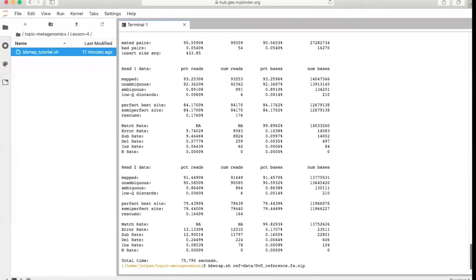And then where you would, if using BBMap, this is where you would tell it the name of the forward read. Now we're gonna give it the first forward read, followed by a comma, and then the second forward read, okay?